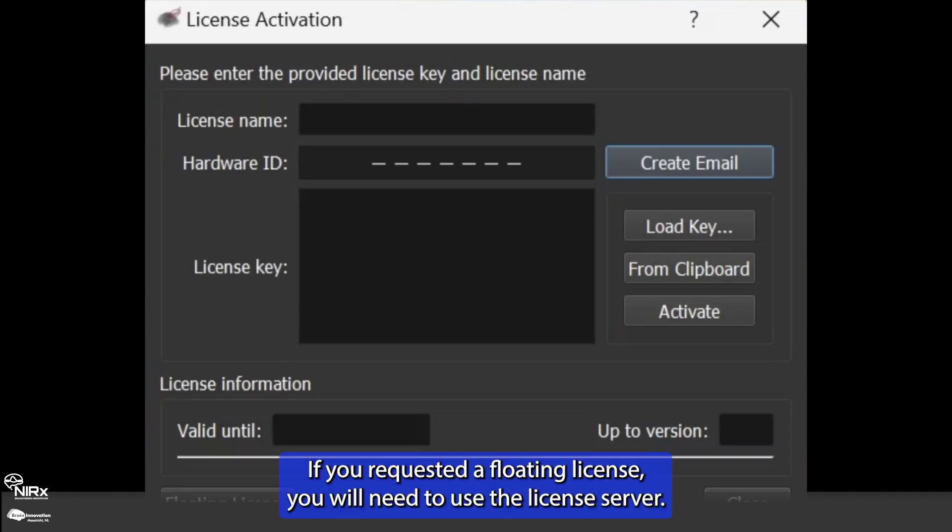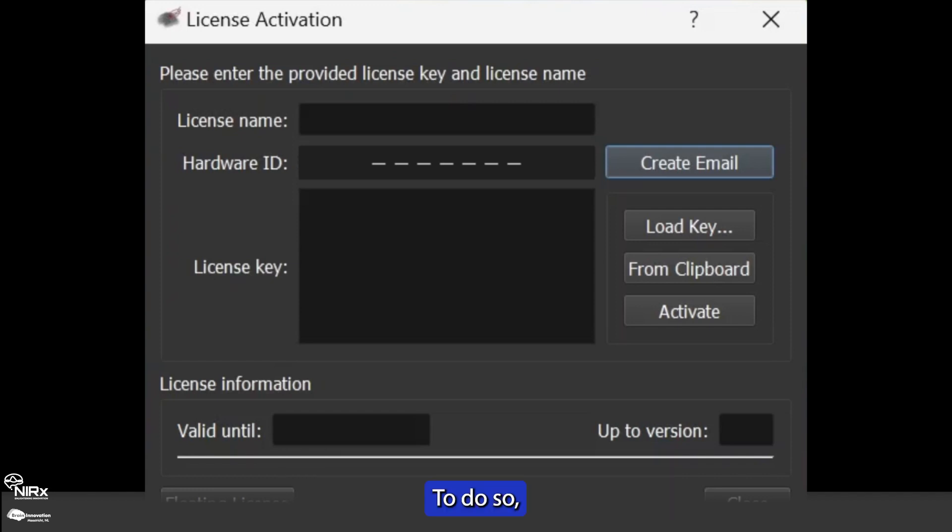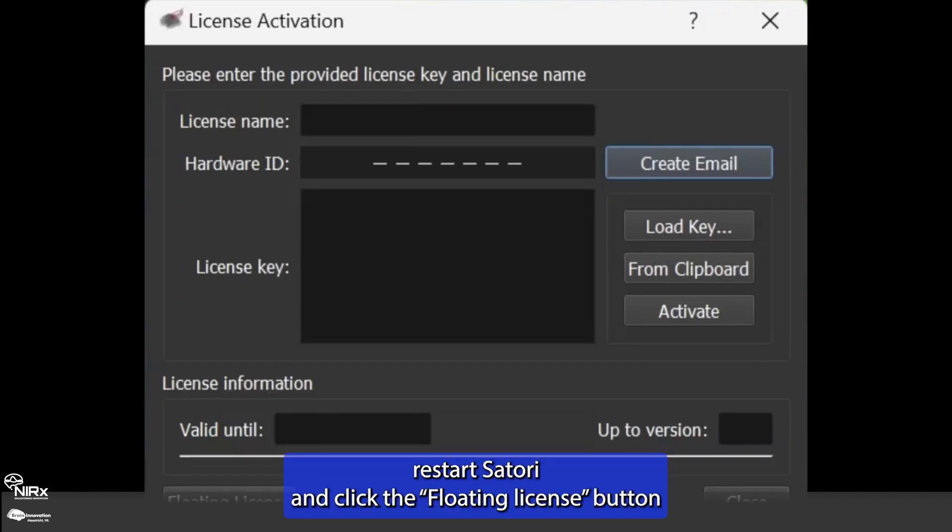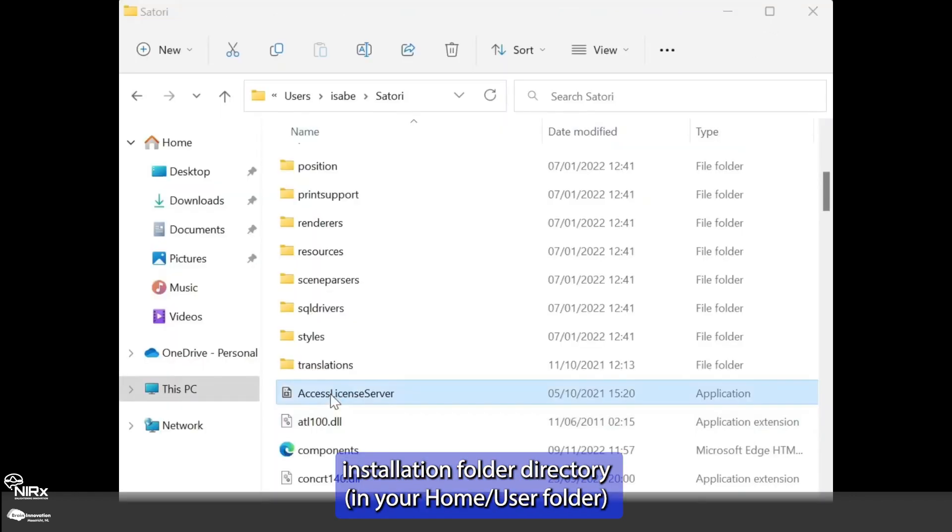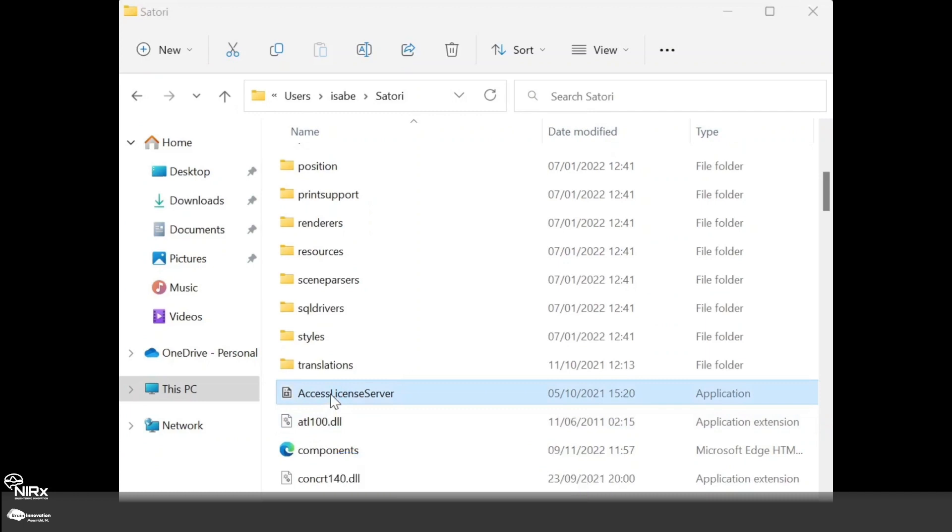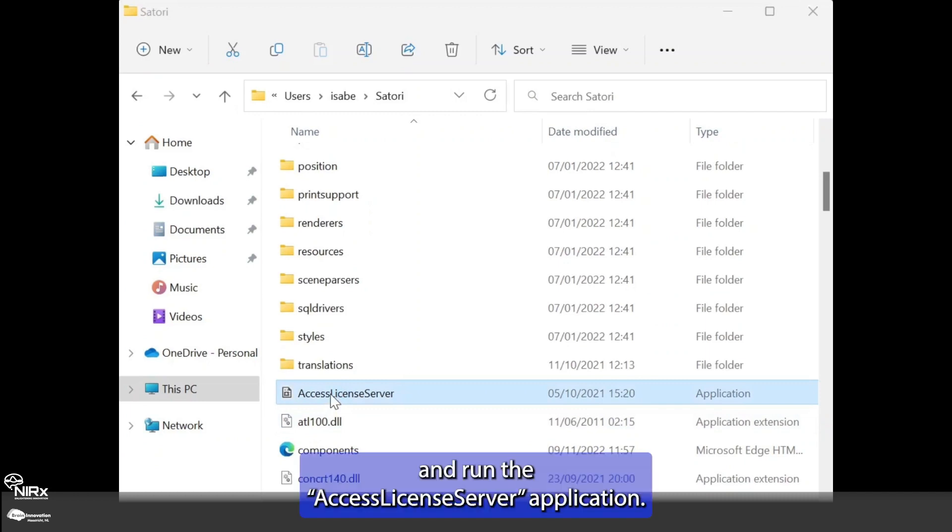If you requested a floating license, you will need to use the license server. To do so, restart Satori and click the floating license button in the bottom left of the license dialog or go to your Satori installation folder directory in your home/user folder and run the access license server application.